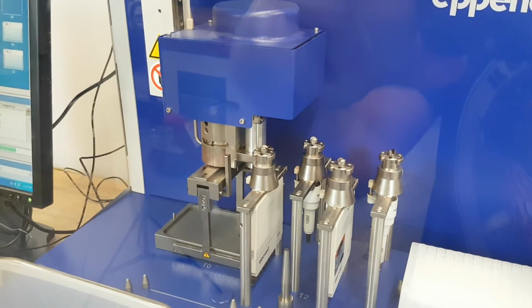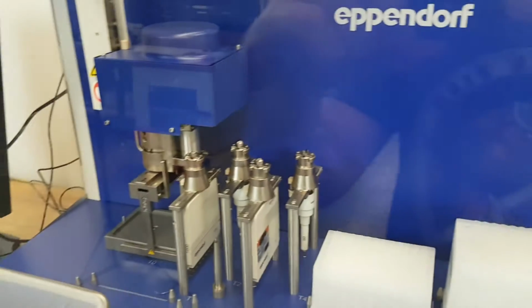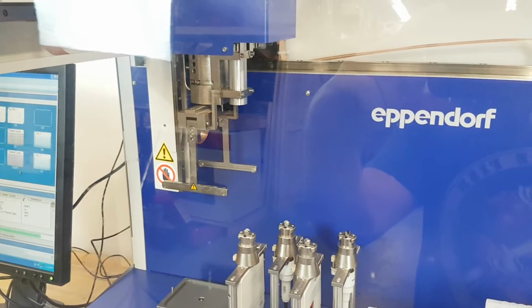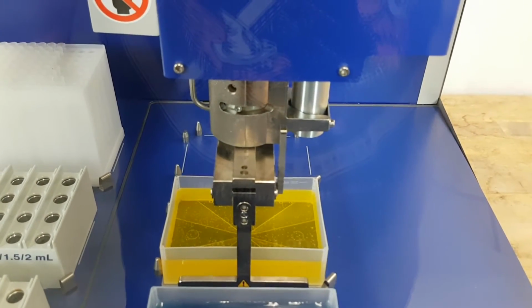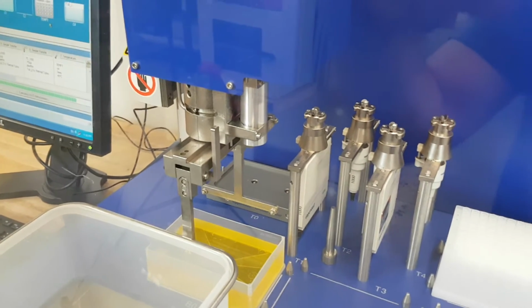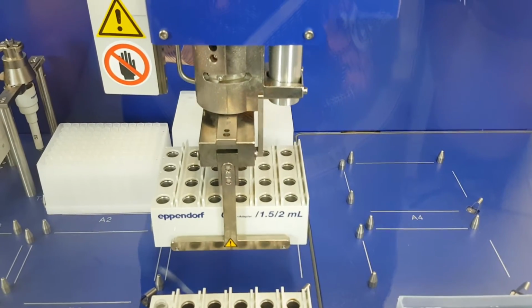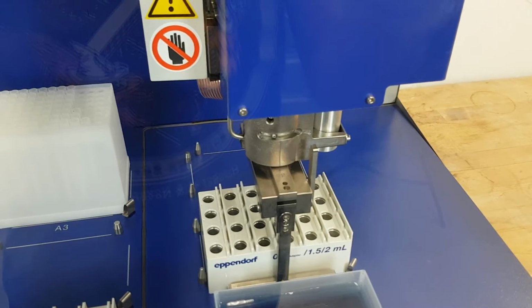So right now it's taking the grabber, and it will move the yellow tub over to the far side as its first move. It's pretty impressive. It manages to lift and move the yellow tub, which is pretty full, without spilling. And here it goes. It's open, it closes. That's better than I can do, honestly. So now it's going to move this one over to the side to demonstrate that it can move different items. And now we are complete with the grabber demonstration.